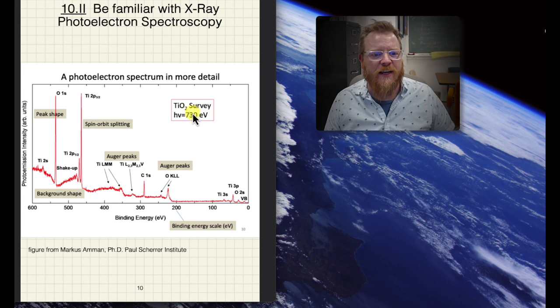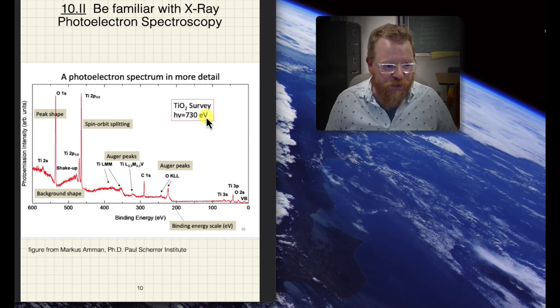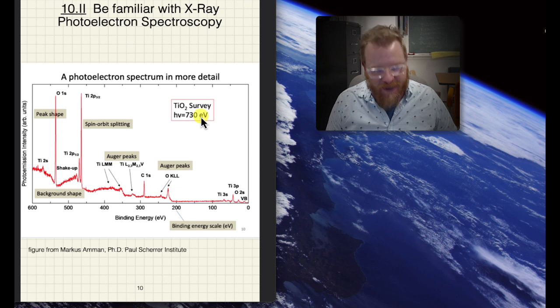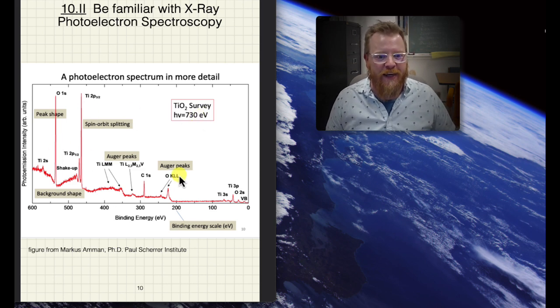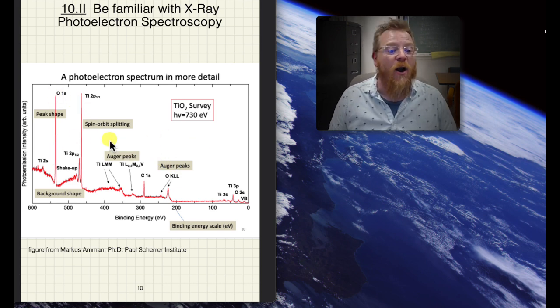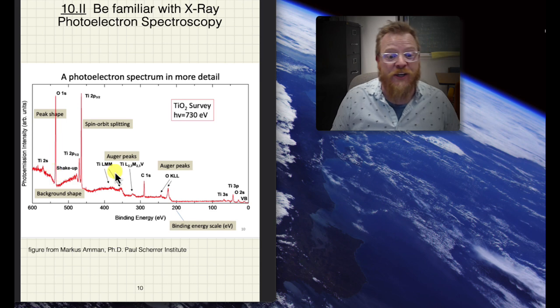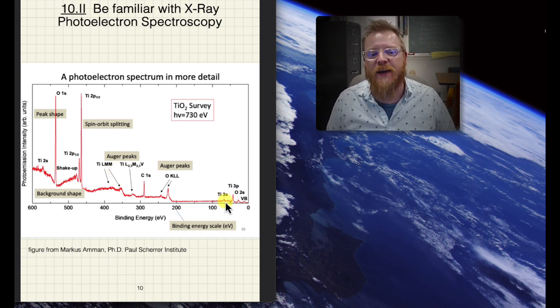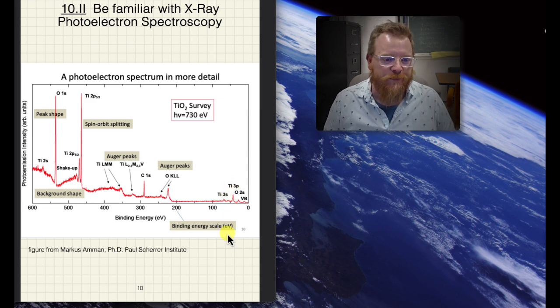And you can see here it's telling us the energy source, 730 electron volt, was the radiation used. So that gets subtracted from the electron kinetic energy, and thus we get the binding energies. So you'll notice here the things at like 1s and 2s are at a much higher binding energy than things like 3s and 3p, which again makes good sense because those 3s and 3p levels are easier to remove.